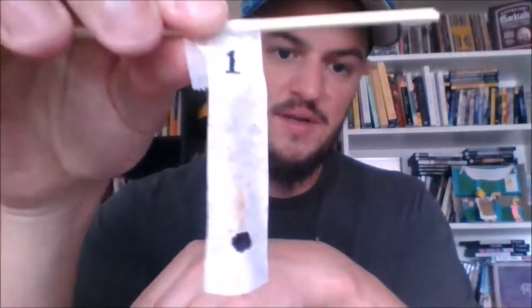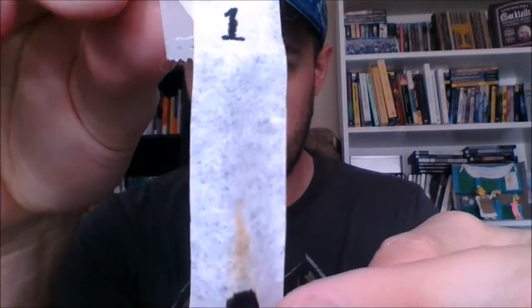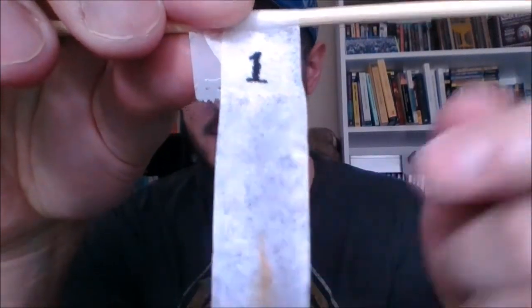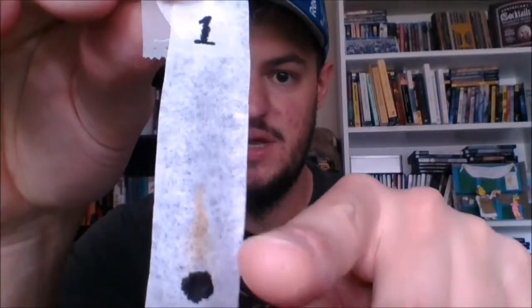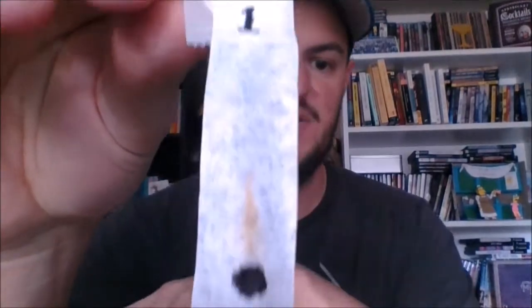Now this one, when we look at this, the dot itself didn't change very much, but there's a strange, rusty, yellowy orange streak that has started coming up from the top of this dot that wasn't there before. So, take your time, do your observations. The black mostly stayed put, but this weird orange did streak out of it. Kind of looks like it's smoking, like it's on fire a little bit.